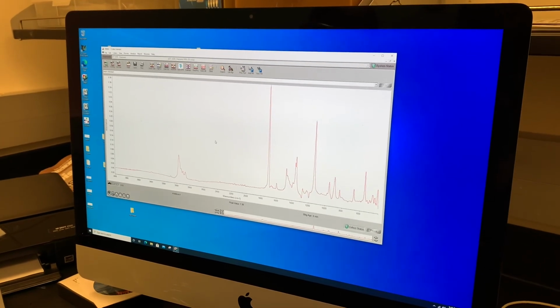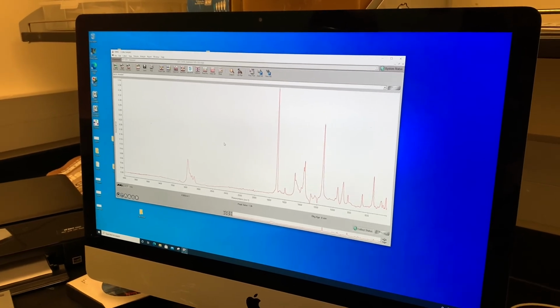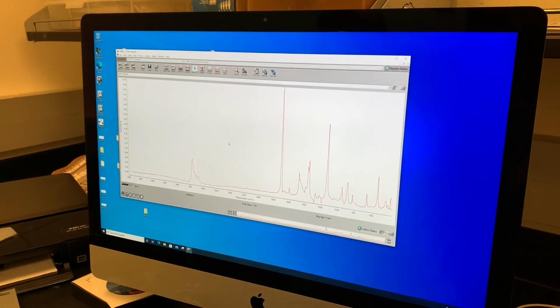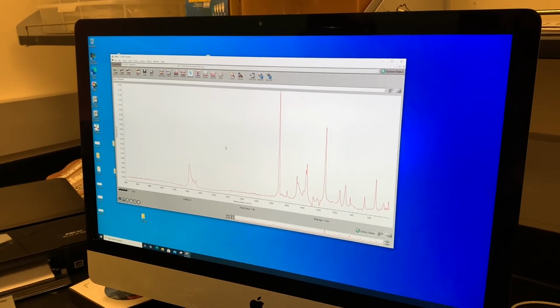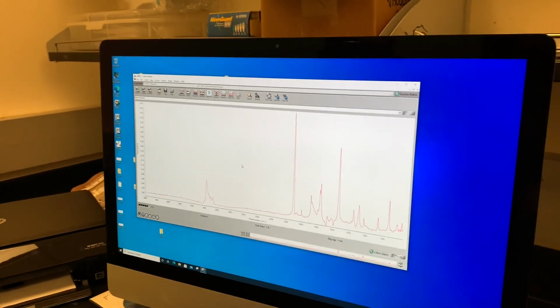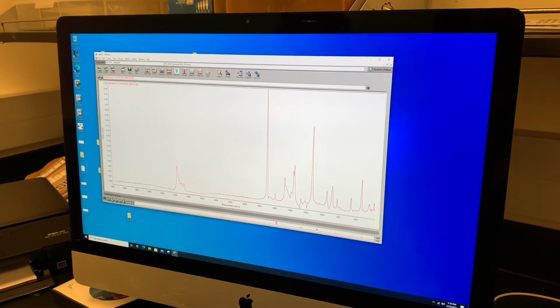Now, for this particular product, I don't really want to measure the boiling point. That is normally one of the ways that we identify it and also test its purity. But measuring the boiling point of a small amount of liquid is really a hassle. So instead of measuring the boiling point, I'm going to use the IR as the one and only way of determining the purity of the product and also the identity of the product.